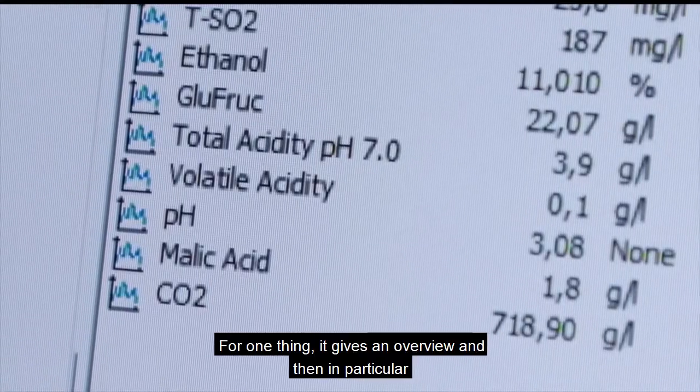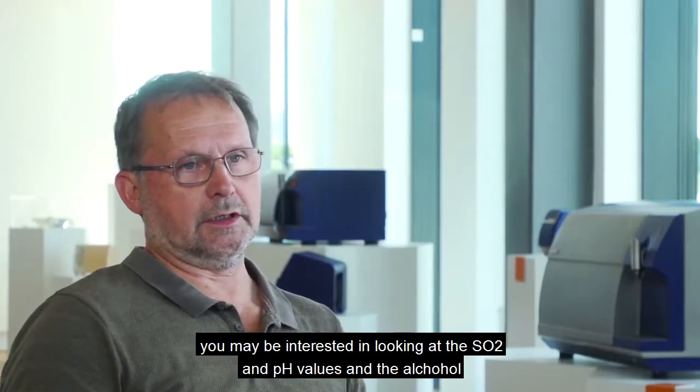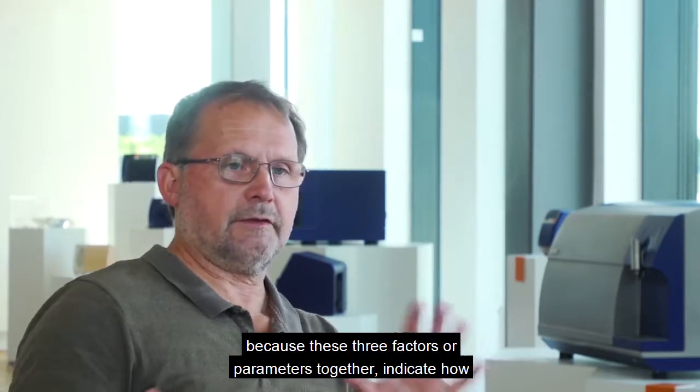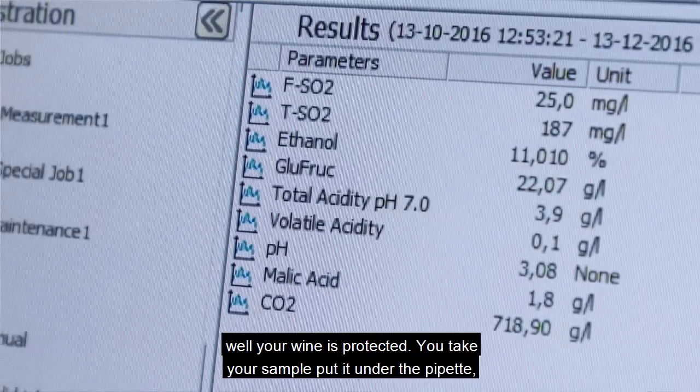For one thing, it's giving an overview, and then in particular, you can have interest in looking at SO2, pH values, and alcohol, because these three parameters together indicate how well your wine is protected.